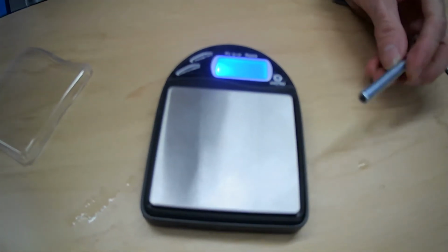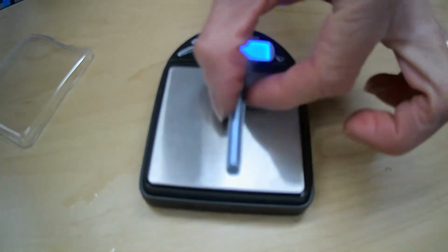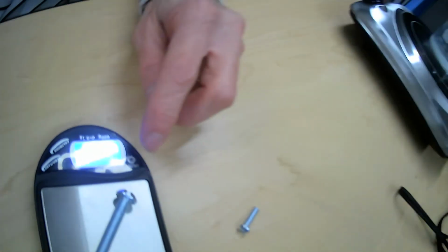Okay, so I'm going to mass these bolts. This is the big bolt. Try to get it so it doesn't roll off. There we go. And I don't know if you can see this, but it says 112. Try to get that so you can see it. There's a little bit of a glare. Trust me. It says 112 grams. All right, that's 112 grams. That's, nope, I lied. That's 11.2. 11.2 for the big one. Small one is 2.0. So 2.0 for the small one. What was the big one? 11.2. Okay, those are the masses of the bolts.